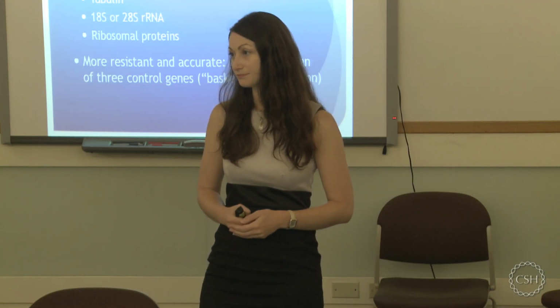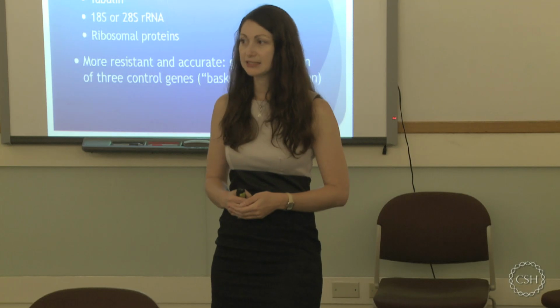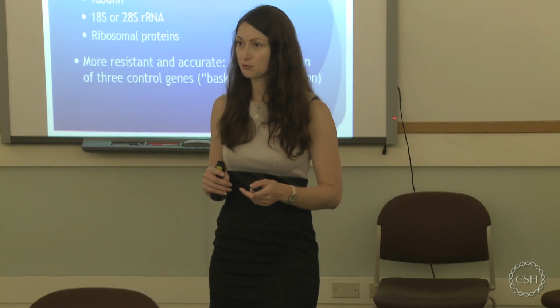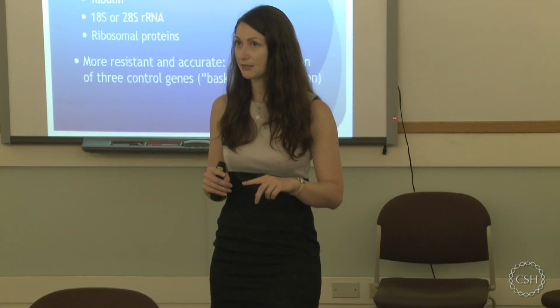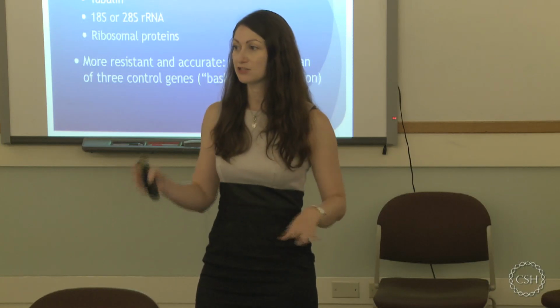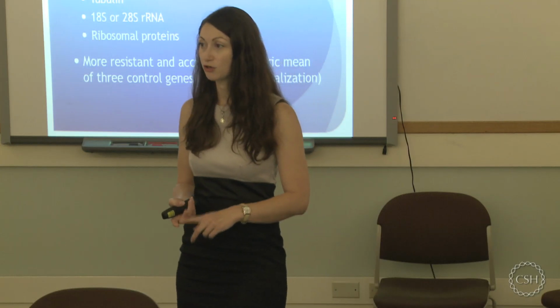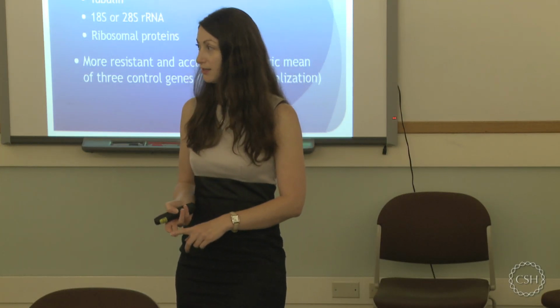What's your quantification there? So usually you're good with Nanodrop, unless... The range of Nanodrop is between 10 nanograms per microliter and 2,000. So if it's a lot less or a lot more, you either dilute it or you have to use a different method, which would be Bioanalyzer or Qubit, fluorescence based.